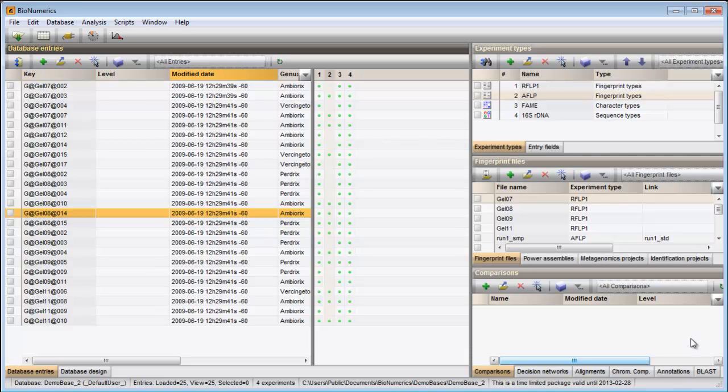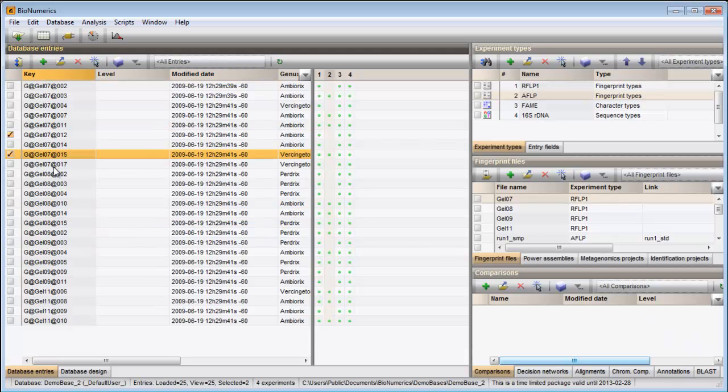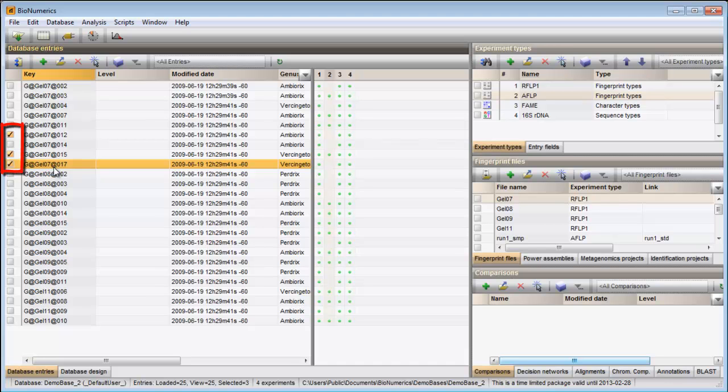A single entry can be selected by clicking on the entry while holding down the CTRL key. Selected entries are marked by a checked box appearing next to the entry.